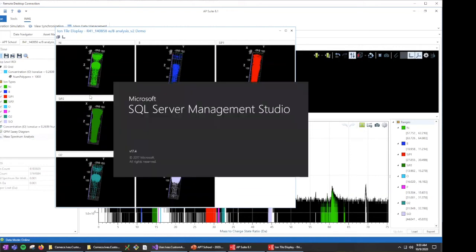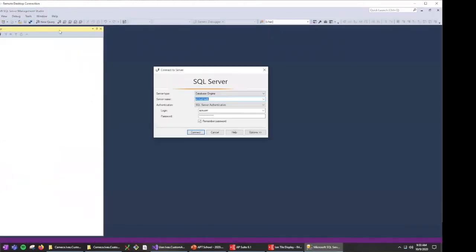So you were talking about the new file format. I think it was called APT, right? Yep. Does that already contain all of the info that you would have in your database? It doesn't now, but the plan is to include it as one of the options when you save a reconstruction. Check a box to say also save the metadata, and that will include all the data that you could possibly get through a database. That's your project information, your experiment details, that sort of stuff.